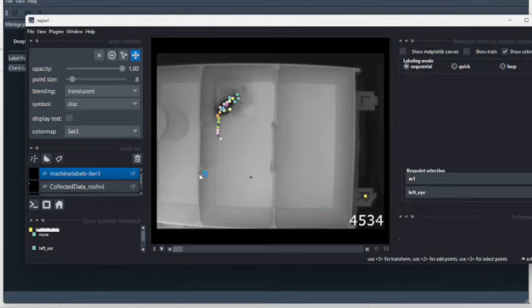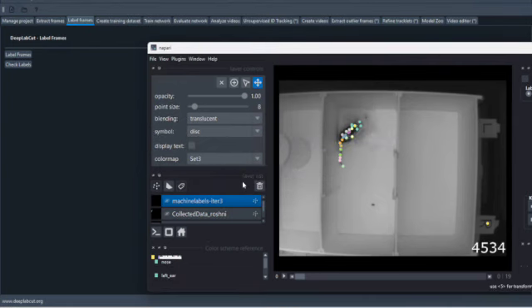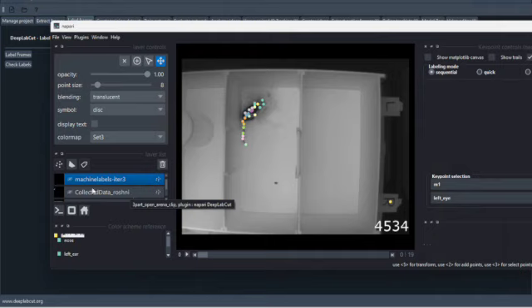So you can see on this machine labels layer, I still have this pup point that I just deleted, because these are what DeepLabCut originally put down as the machine labels. And essentially it compares its labels that it defined to this new layer. If I were to relabel this frame and then save it, it will save over this collected data Roshni layer.